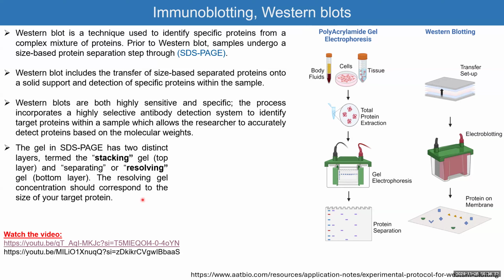There is a detail that I added here for you, that normally the SDS page has a stacking upper part and a resolving lower part. I'm not going to ask you about this in the exam, but when you go in labs, you should know how to prepare the SDS. In the protocol, it will tell you how you make this and how you make that.